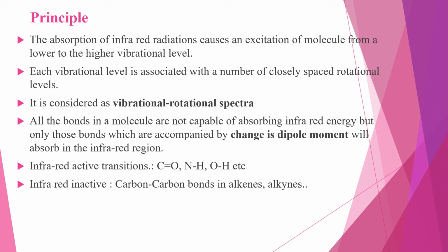All the bonds in a molecule are not capable of absorbing infrared energy, but only those bonds which are accompanied by a change in dipole moment will absorb in the infrared region. Such vibrational transitions which are accompanied by a change in the dipole moment of the molecule are called infrared active transitions. So, these are responsible for absorption of energy in the infrared region. On the other hand, the vibrational transitions which are not accompanied by a change in dipole moment of the molecule are not directly observed, and these are infrared inactive.